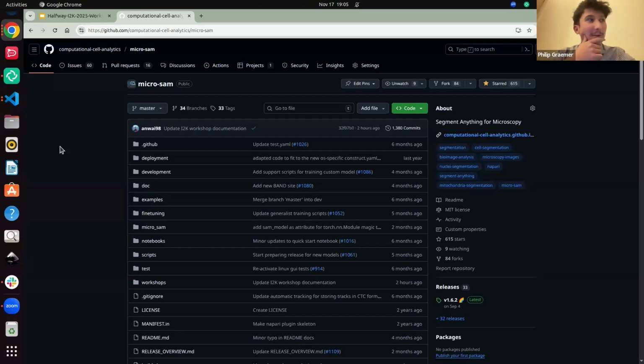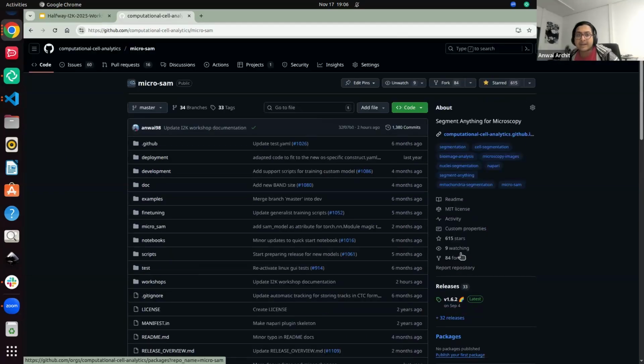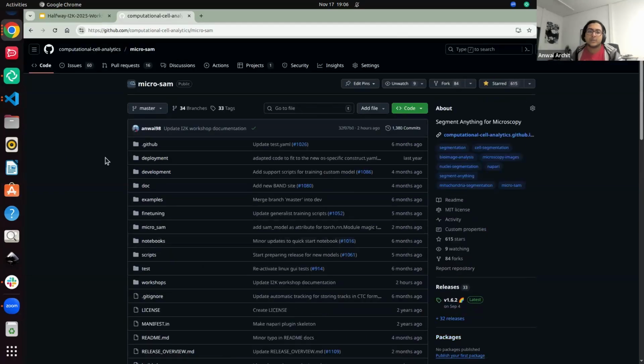The first one, what's the main difference between the earlier releases of Microsam and your newest release? Did you retrain the model? So you mean a release which is in production already, or the Microsam 2 thing which I teased? Let's first say the newest one that's out in production, and then what you're doing right now.